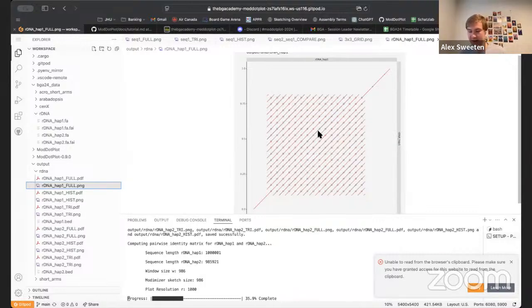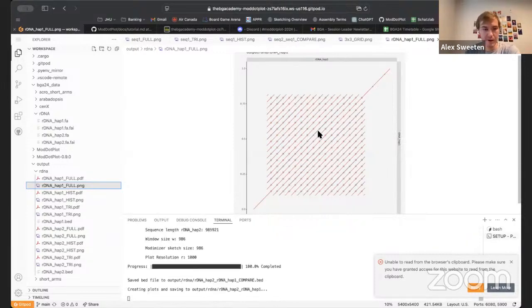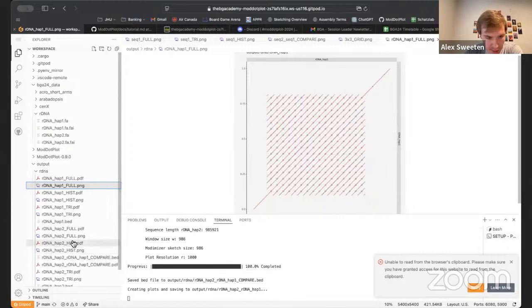Cool. This is probably from chromosome 14. I think that one has the lowest number of rDNA copies. And this ranges, by the way, from I think 14 to 71. I think chromosome 15 is crazy with how much rDNA it has. So with the 71 copy rDNA, it's not really realistic to count all the copies out, but you can do that if you are so inclined. I think the second haplotype is done, so I'm going to go ahead and show that.